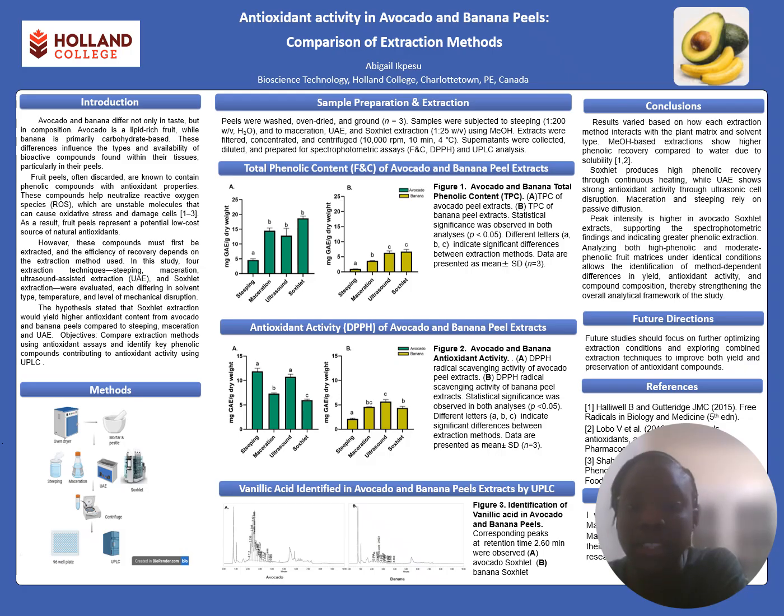For DPPH, we see that steeping and ultrasound had no significant difference, but there was a difference between the maceration and the Soxhlet. And for the banana, we could see a very interesting trend here. Steeping also came out to have a significantly lower value than the others, but maceration had no significant difference from UAE and Soxhlet, but ultrasound had significant difference from Soxhlet.